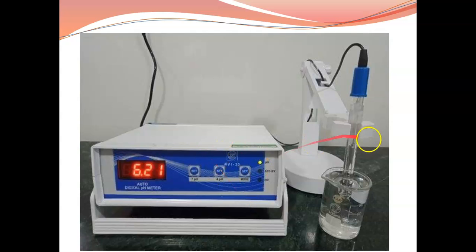Now here it is shown. Now this is a glass electrode which is actually a combined electrode because it is having both the reference and the indicator electrode in it, as we saw in the previous slide. This glass electrode, as you can see here, is made up of a glass tube, broad glass tube, and at the bottom there is a bulb which is highly sensitive, with high conductivity and pH sensitivity. Also, there is a solution inside this glass electrode of 0.1 molar hydrochloric acid. So, the concentration of hydrochloric acid inside the glass electrode is maintained constant.